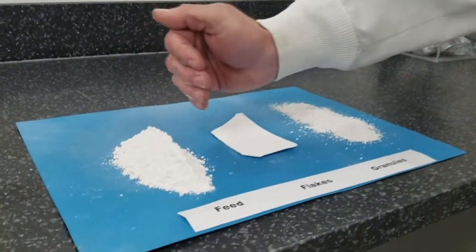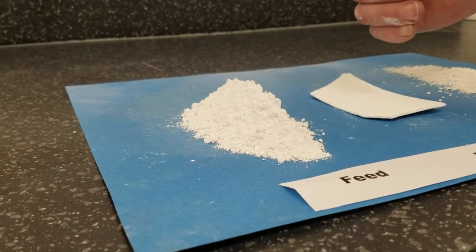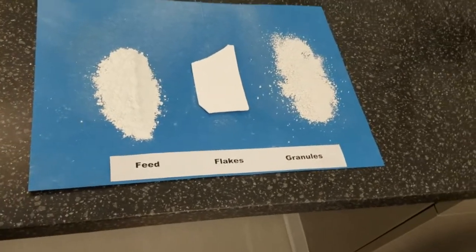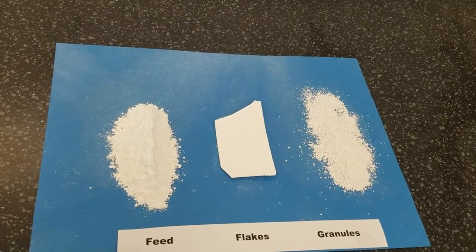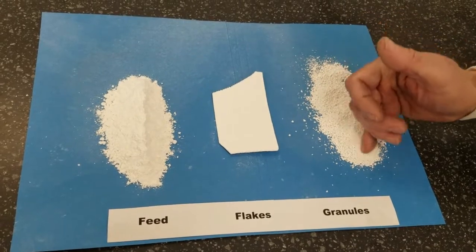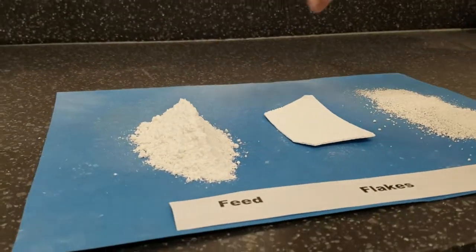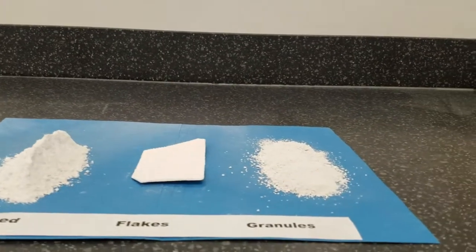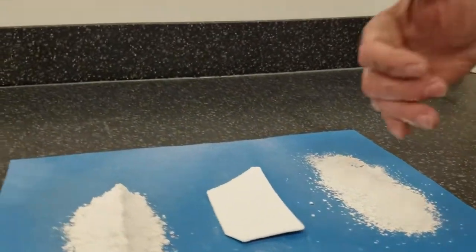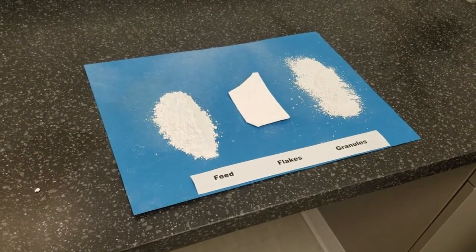I just demonstrated that the material we were given here does not have good flow properties. What the Alexander Work machines do is they take the very, very light, fluffy powder — I'm calling that the feed — and compress it between two counter-rotating rolls into a solid flake. No binders are used, only high hydraulic pressure in order to compress the material into the flake. The flake is then gently ground into granules. If you look at the feed versus the granules, you can see the high angle of repose on the left — the material just stacks up and does not want to flow or cascade down. Versus these granules, when I squeeze them together, they fall apart into a much lower angle of repose, which indicates better flow properties for the material.